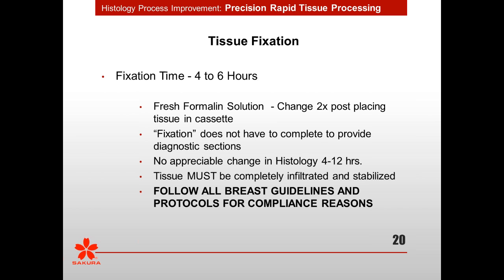And I've worked with University of Miami and Dr. Vernon and Dr. Morales on this about what we're actually trying to do. What we're trying to do is give a consistent artifact. Now, we see no appreciable change in that 4 to 12 hours. There is some change when you look at small diagnostics from 4 to 6 to 8, and definitely when you get into 24 hours. There is a change. It's not going to prevent the diagnosis with that sample, but there will be subtle changes in there.